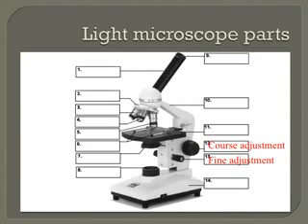One of the most difficult things to do with a microscope is get whatever you're looking at into clear focus. There are two knobs on the arm of the microscope that you can use to get things in focus: the coarse and fine adjustments. The coarse adjustment is the larger of these two knobs. It's called coarse because it very roughly puts things into focus.